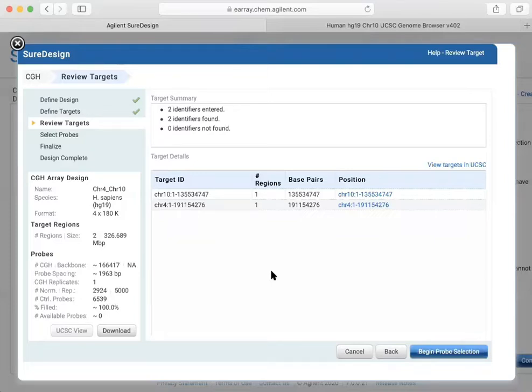Yeah, it starts to become somewhat subjective, because technically you could always keep trying primers and keep working in. So even if it was a 10,000 base difference, you could still get the breakpoint junction eventually.